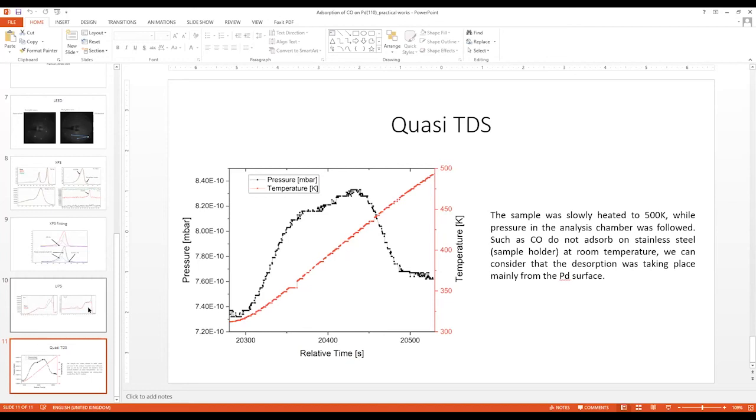Don't worry, for your experiment it will be installed already because we have the new one from Specs. We discussed a lot. They tested it, and then they sent us back the window. It was already not transparent for helium-1 because they covered it with an aluminum layer to make it stronger. Somehow this window was very weak.